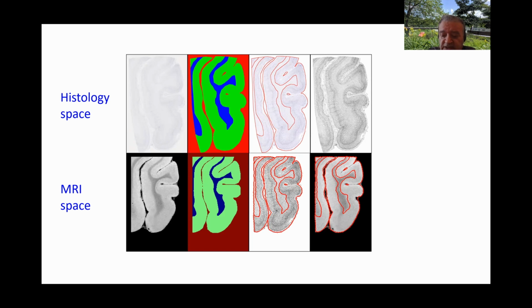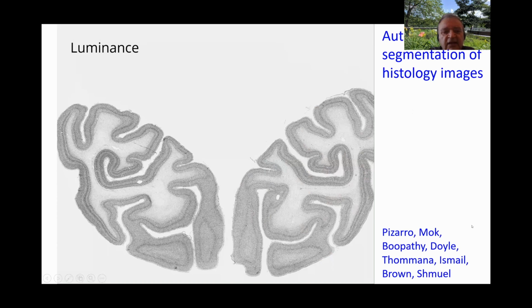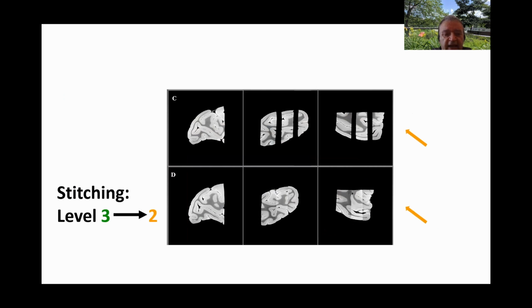And actually these blocks, I didn't mention that, but they were obtained from the embedding in a standard cassette of paraffin embedding. And this means that this width is only 2 centimeters. These are really small blocks. And using standard machinery, we can also stain automatically with machines for immunohistochemistry. And now we want to reconstruct everything.